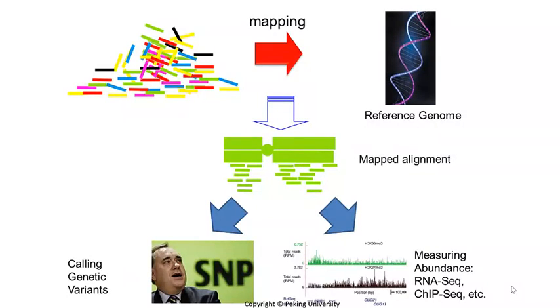Reads mapping has overcome the technical difficulties resulting from the exceedingly short reads produced by deep sequencing. In addition, it facilitates the use of genome coordinates as a bridge to integrate the sequencing data with annotations produced from previous studies.